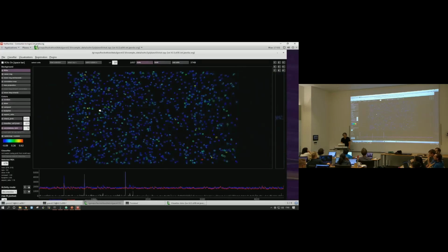Another question. I'm not able to use right click to send the cells to either side. You right click and they don't go. Okay, we'll look into that. You use 2 fingers. I did that, so I changed my mouse settings a couple of times and tried different things. Okay. That may have to do with forwarding through the NoMachine remote interface. Maybe that's the problem. We'll look at that.